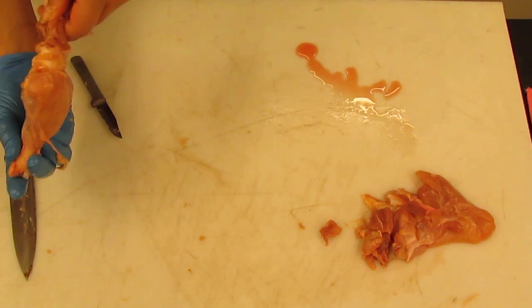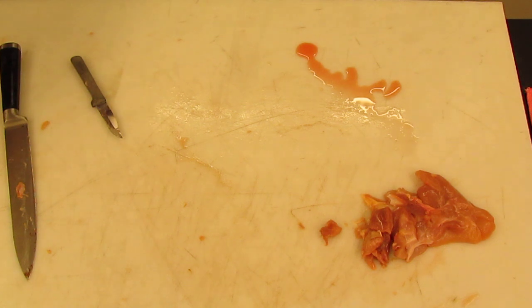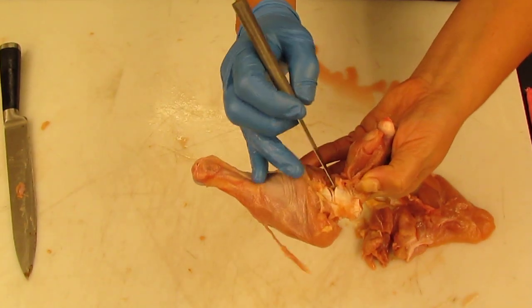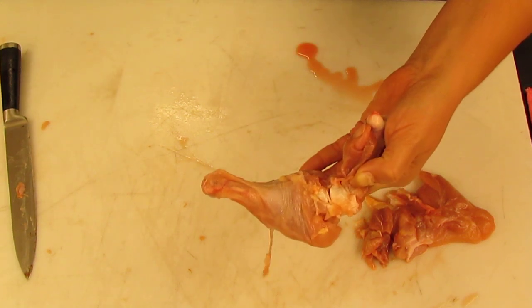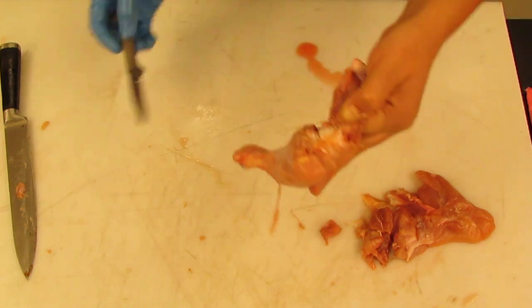All right, so now, again, we're looking at the side of the knee. This is the femur. This nice shiny piece of bone right here is the tibia. And in between them, we can see this little flap. This flap is the meniscus, and that is essentially going to absorb a lot of the shock of the chickens running around being crazy chickens.